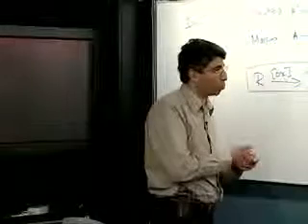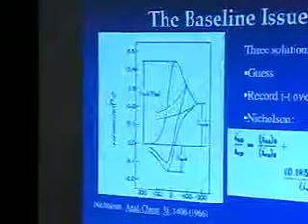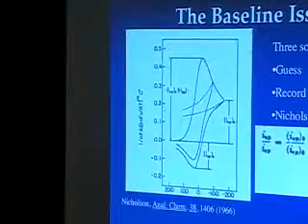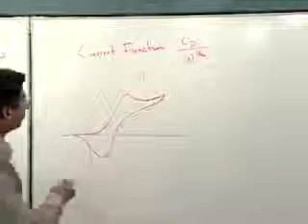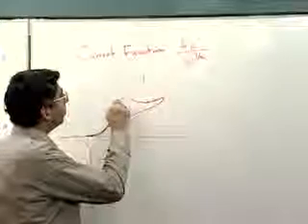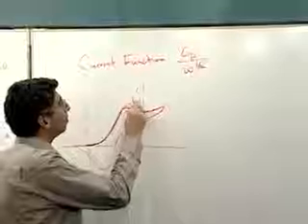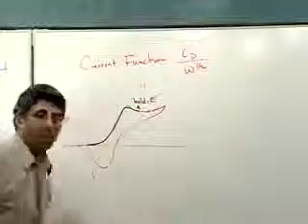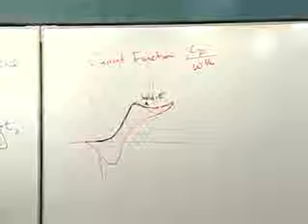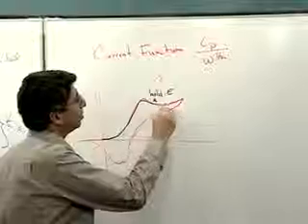But you can't get all your results that way, unfortunately. So the way that is best is run a cyclic voltammogram. Let's say it looks like that evil red curve that I've put right there. And then run a second cyclic voltammogram. However, what you're going to do is you're going to stop your potential, hold your potential at this point right here. And continue plotting the current on a time axis. So switch over from a potential axis here to a time axis.